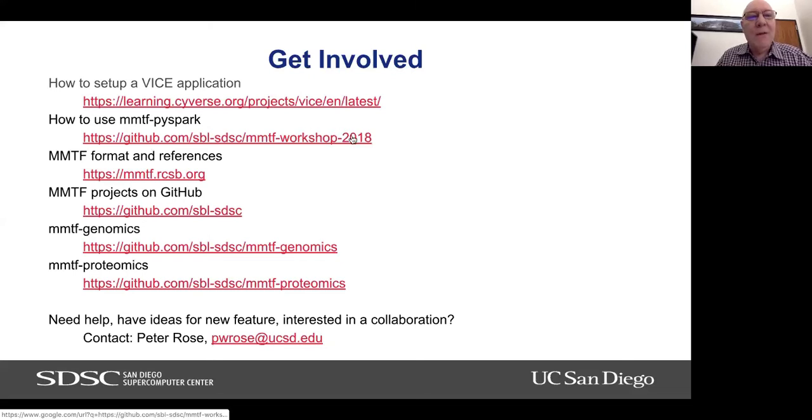If you want to know more about our project, we have an entire 3D workshop, which is online. This is the workshop we had last year here. There are many materials, about 100 Jupyter notebooks doing all kinds of different types of analysis. If you want to know more about it, you may want to work through this notebook. This is not available on CyVerse yet, but hopefully next week we will deploy this also on CyVerse, so you can just run this entire workshop in CyVerse.